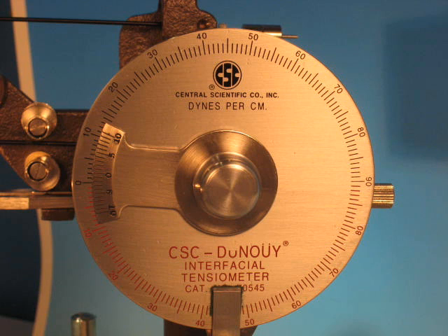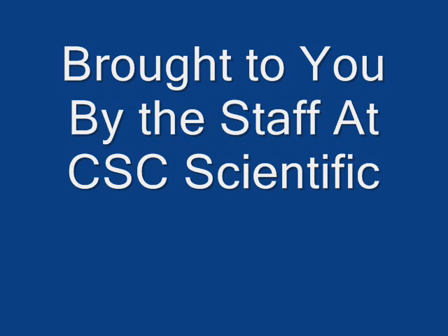At this point, the position of the dial indicator is the surface tension in dynes per centimeter. These are the steps to do a surface tension measurement using a CSC scientific tensiometer.